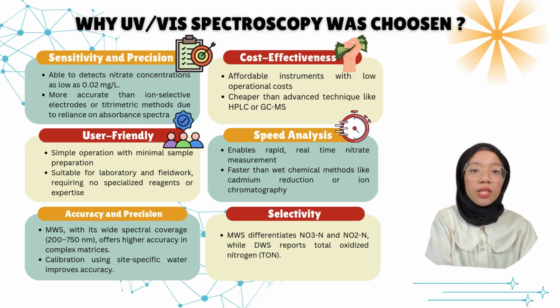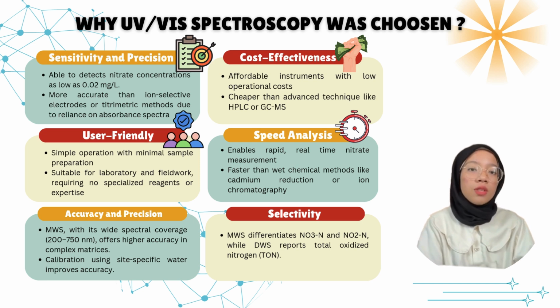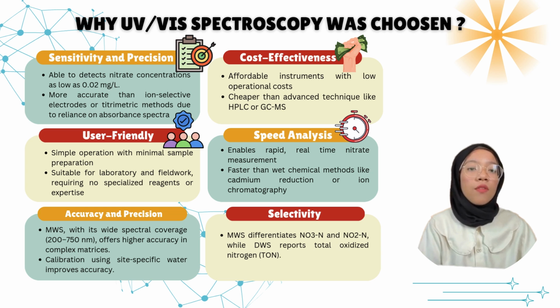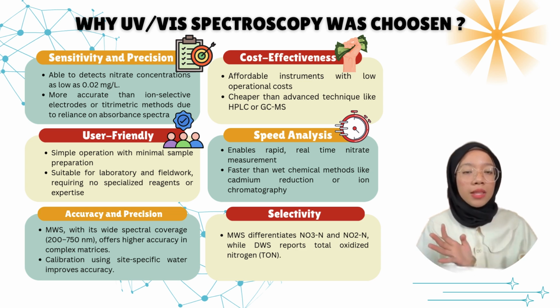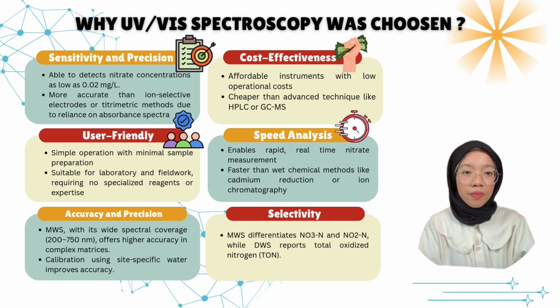Another reason for choosing this method is its simplicity. UV visible spectroscopy is user-friendly, requiring minimal sample preparation. It is suitable for both laboratory settings and fieldwork, and importantly, it doesn't require highly specialized reagents or expertise, thus making it accessible for routine monitoring.